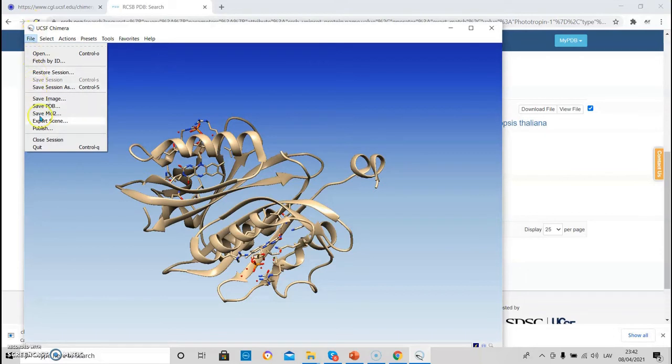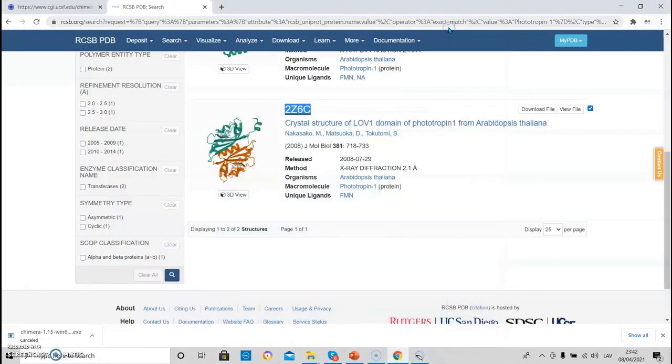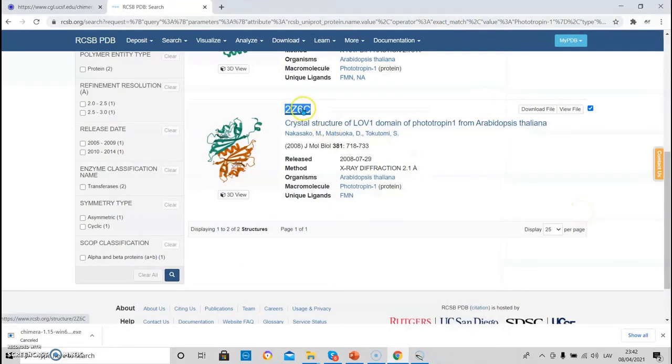To close the session, we need to press file close session. And there is a second way how to load the structure.